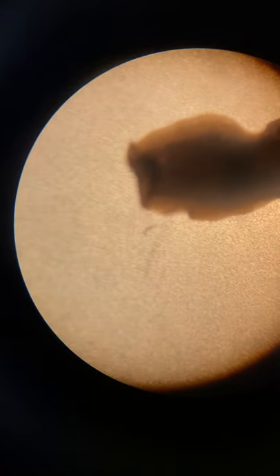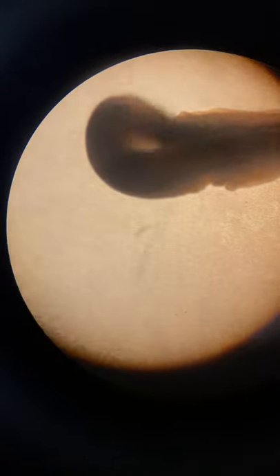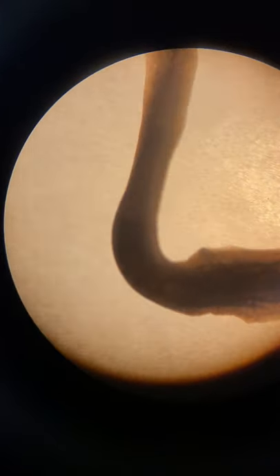There's the planarian right there — this is his back side. You can see these two little dots, those are his eye spots. This side that we're looking at, his back side, is the dorsal side.